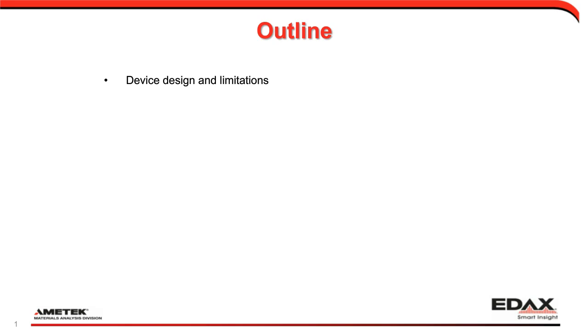That's what we detect. The next step will be what we do with what we detect. We have a pulse processor in the signal chain as well, which also imposes some limitations in what can be done. So we'll talk a little bit about the pulse processor and what we're actually changing when we're changing the speed or throughput of our acquisition.